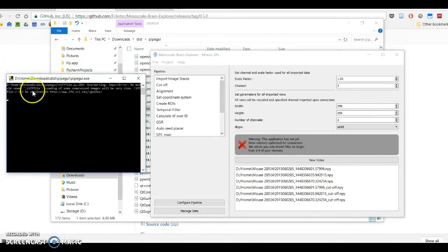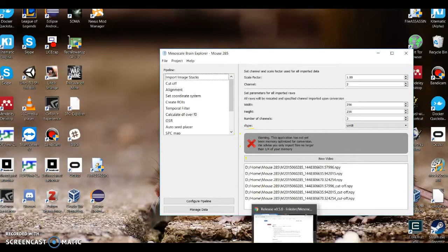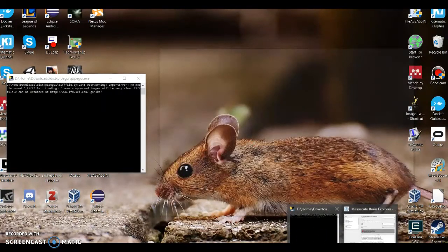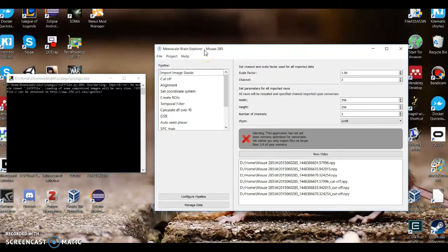You will notice, for instance, that TIFF files load slower in the exe version of this rather than when you're running it, say, via PyCharm as a developer. However, it's not slow to the point that it destroys the functionality of the application. So the "very slow" over here seems to be overstated.